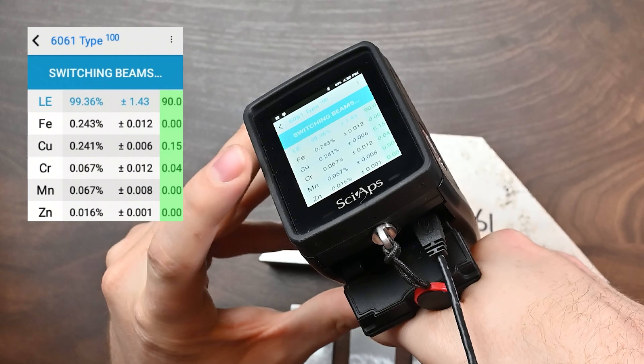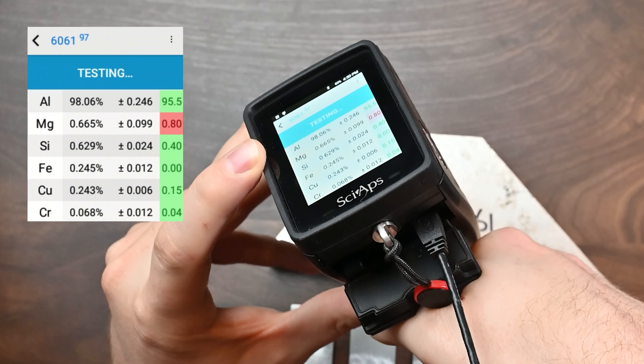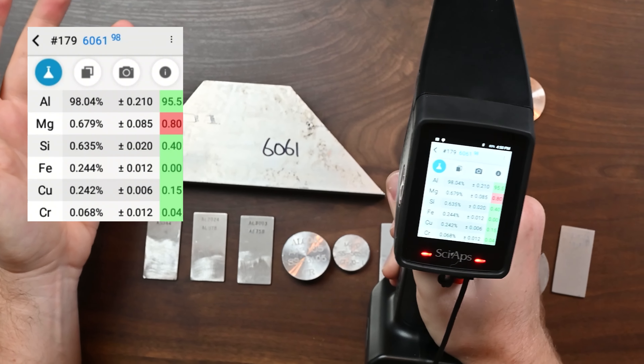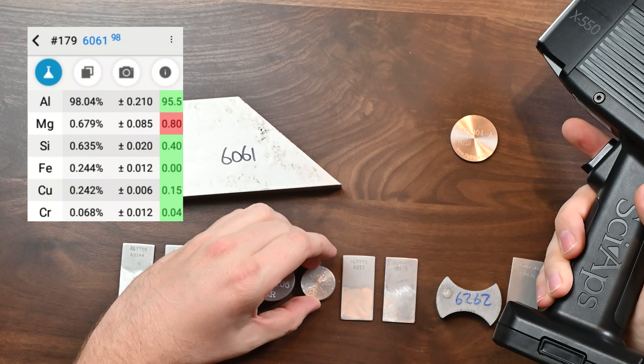So if I go back on the 6061 and hold the trigger down, eventually you're going to see 'switching beams' up here. And now when you see that, you're going to switch over and start looking at light elements — you're going to see the magnesium and silicon start to populate. And that's exactly what we see, and we still have a great grade match, even on this material that doesn't have a perfect surface finish.